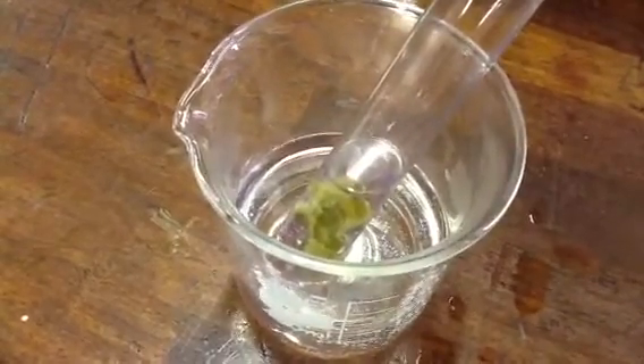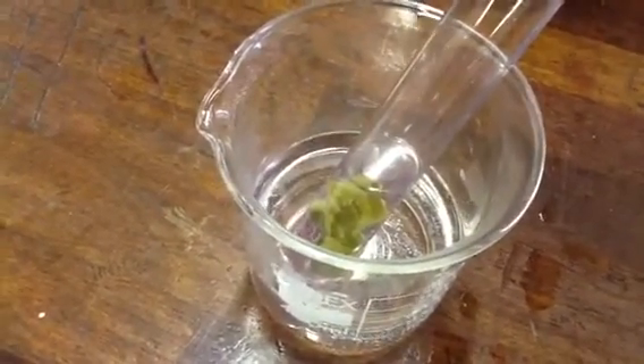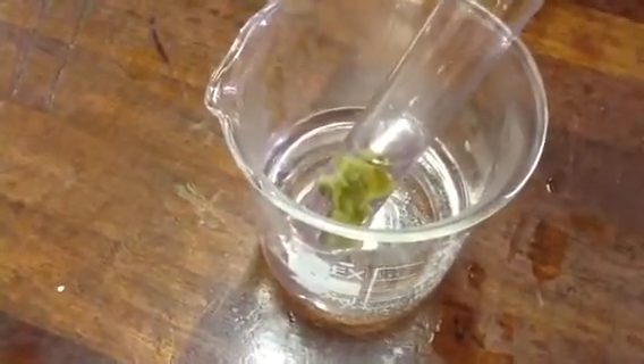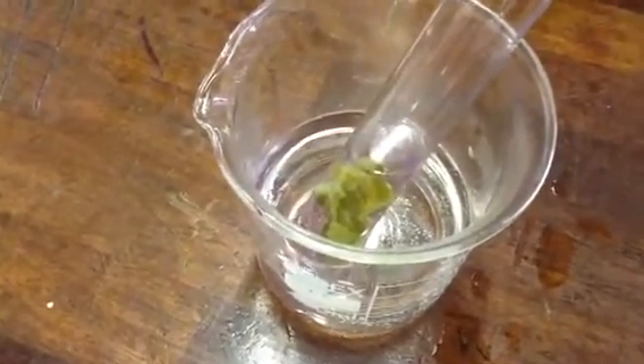And what colour is chlorophyll? Who can tell me that? Green. Excellent, very good — green, yes. So it's going to remove the green chlorophyll.